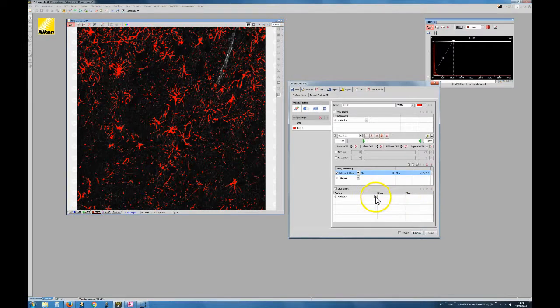So what I can do is I can go to this area, and then I go here, and I say, for each object, I want the intensity, and I want the mean intensity of the green, and I also want the mean intensity of the far red. And now I have the mean intensity of the green and the far red over the whole field per small objects, which is per small red dot, let's say. So I'm happy with that.